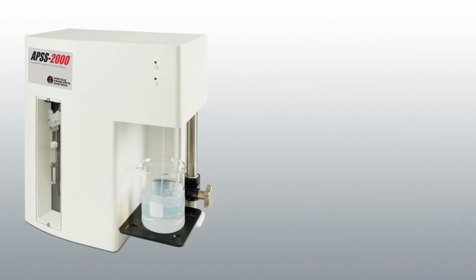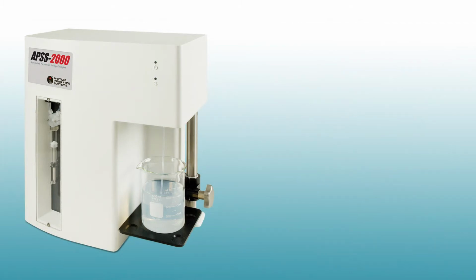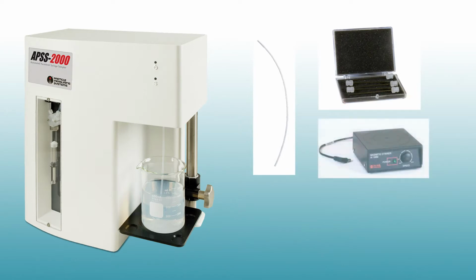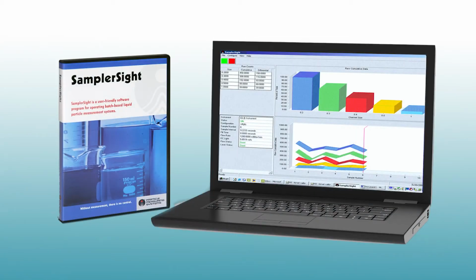So when you purchase an APSS 2000, it includes a particle counter, syringe sampler, software, and a validation manual. It comes with flexible sampling options. You can have tubing, you can have needles, you can use a magnetic stir, an ultrasonic bath, or an IV bag holder. And the software is simple yet functional. It's graphical, tabular. You can generate reports either manually or automatic, and the entire system is 21 CFR Part 11 compliant. And then you have a calibration wizard to ensure that your instrument is always in calibration.